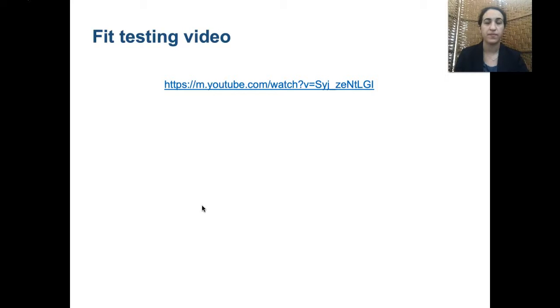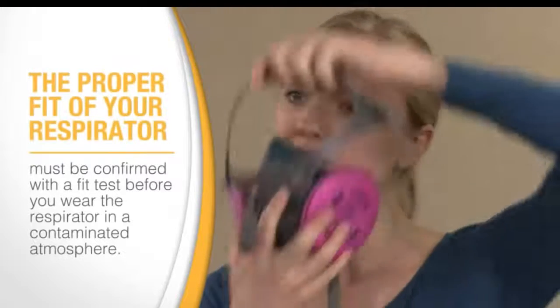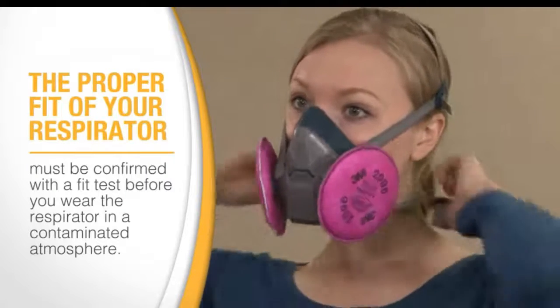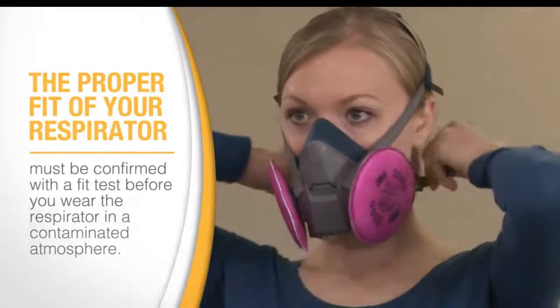Let's watch it now. Prior to being fit tested in any respirator, you must have completed a medical evaluation, which determines your fitness for wearing a respirator. The proper fit of your respirator must be confirmed with a fit test before you wear the respirator in a contaminated atmosphere. This must be done for all tight-fitting facepieces.